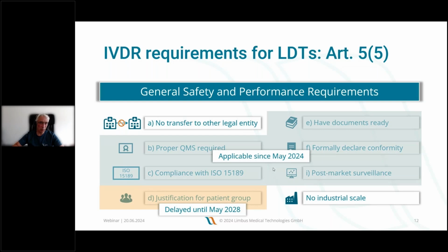But apart from that detail, everything else has to be fulfilled. And again, I'm rather curious, and I'm not judging. I just like to know: laboratories are now required to make publicly available a formal declaration of conformity that their in-house tests are compliant with IVDR requirements.